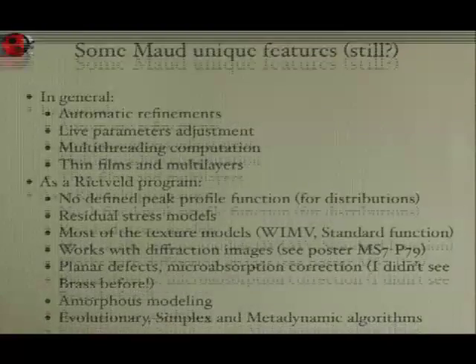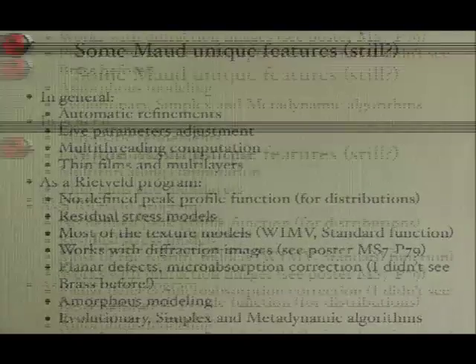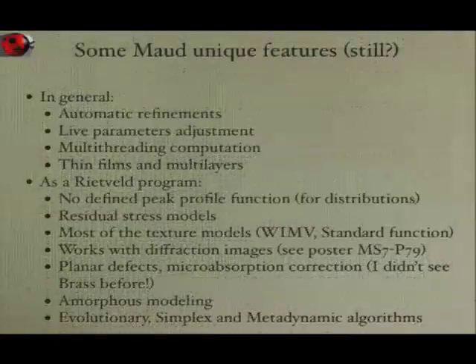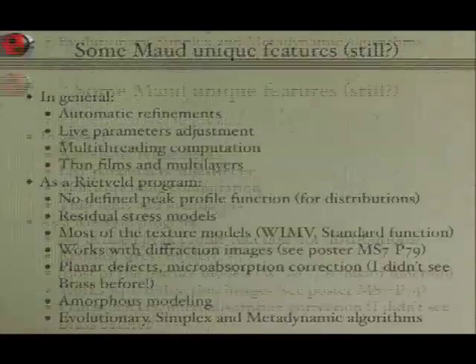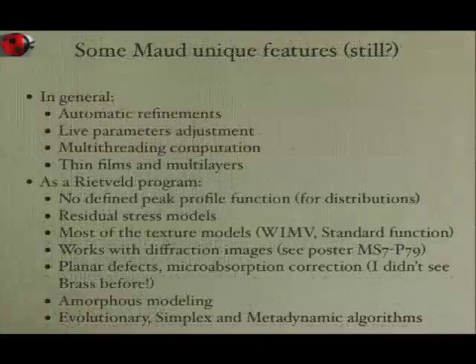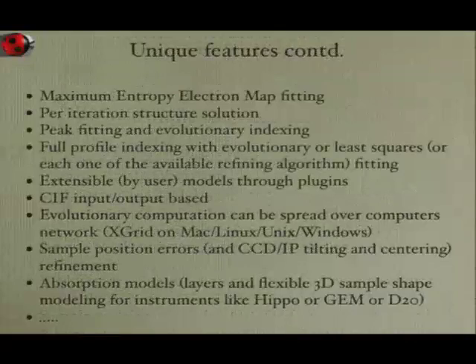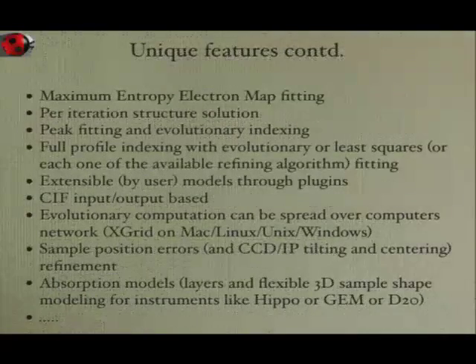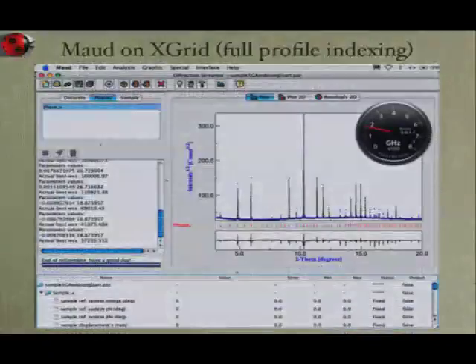Okay, so we have micro-absorption correction and planar defect. Micro-absorption correction is also implemented in BRASS. Actually, I don't know, I didn't see BRASS news in the last one or two years, but maybe. Amorphous modeling and different algorithms, that we have already seen. These I think we skip.